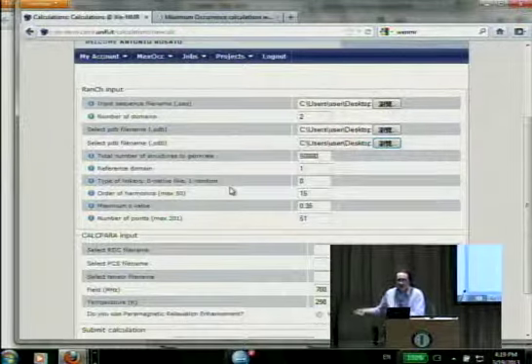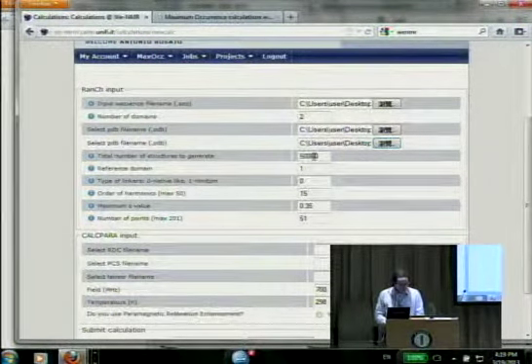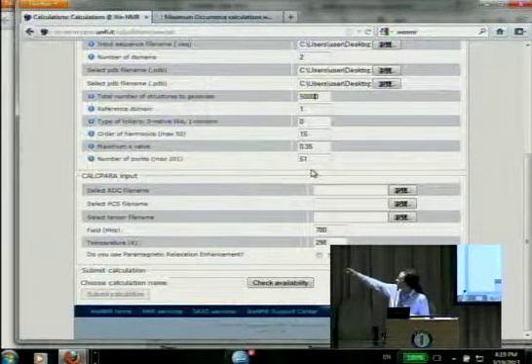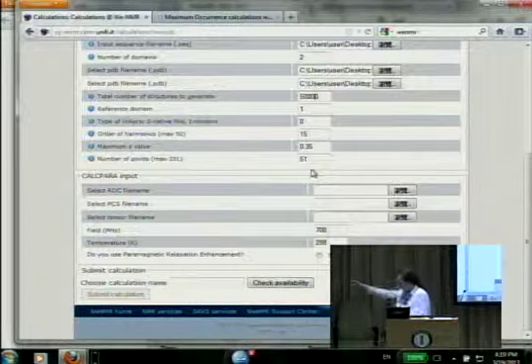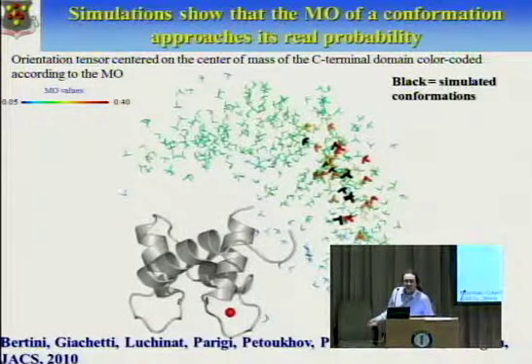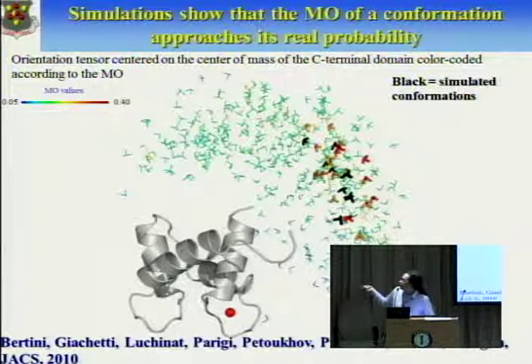And now, as I mentioned, we are just generating these 50,000. No, because it's arbitrary. Actually, in principle, you compute each ensemble in an independent manner.